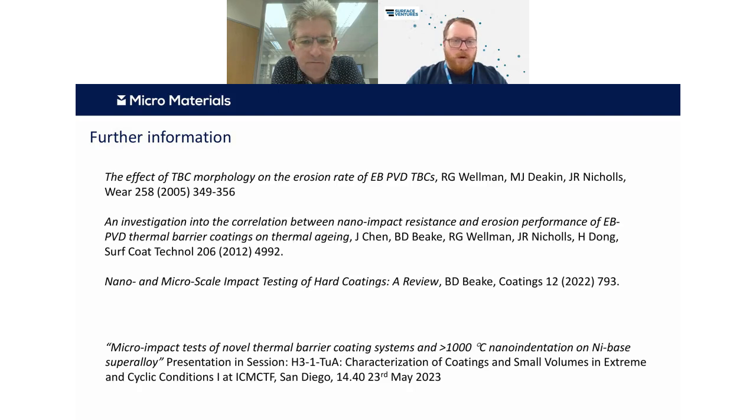And it can work up to high temperatures as well. The random impact we haven't done at high temperatures yet, but there's no reason why not. It's fully integrated with the system, and we've certainly done micro impact up to 600 degrees perfectly happily on hard ceramic coatings, seeing some quite clear differences with microstructure. I think it would be quite easy to have a look at, and it's one of the things in the project that we do plan to do. We're about halfway through this project at the moment, and as we finish it off, that's one of the things we'd hope to look at. It'd be very exciting to see the results from that.